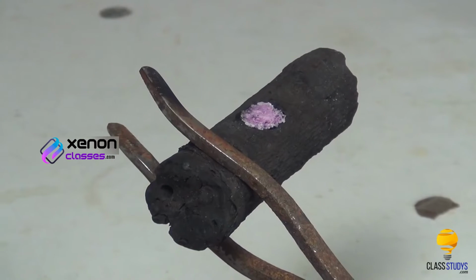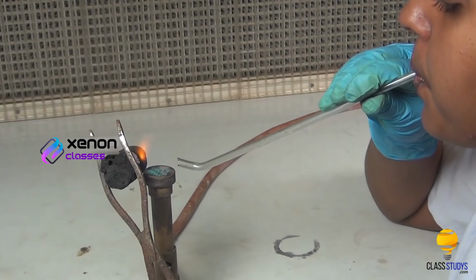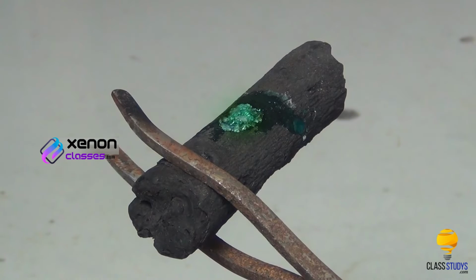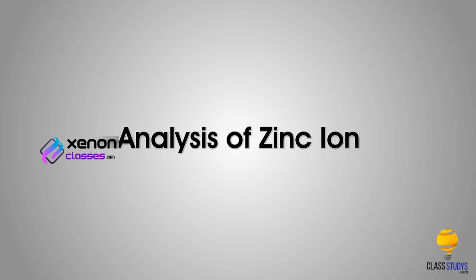Using the tongs, hold the charcoal piece in front of the oxidizing flame of the Bunsen burner. Now, direct the oxidizing flame on the cavity by means of the blowpipe and heat strongly for some time. Formation of green residue indicates the presence of zinc ion. Next, we look at the analysis of zinc ion.